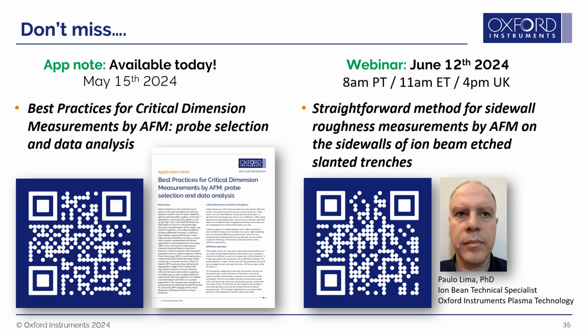Great. And for the tapping mode images, what amplitude did you use, and how important is selecting the right amplitude?